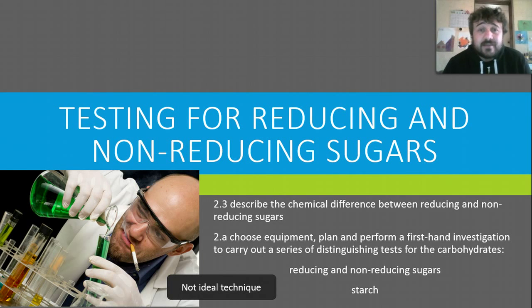Right, dudes. Now that we've covered what carbohydrates are, let's look at how a forensic chemist would test for these carbohydrates. This is really interesting, and it's fairly important to the work, because quite a lot of organic matter is carbohydrates. We'll start talking about proteins and DNA in a future lesson.